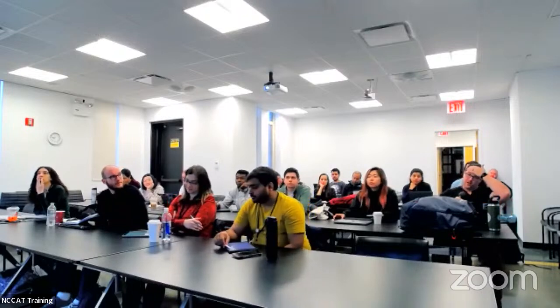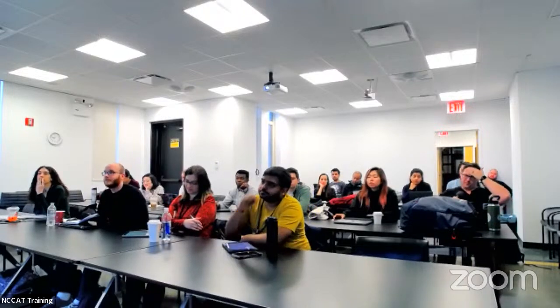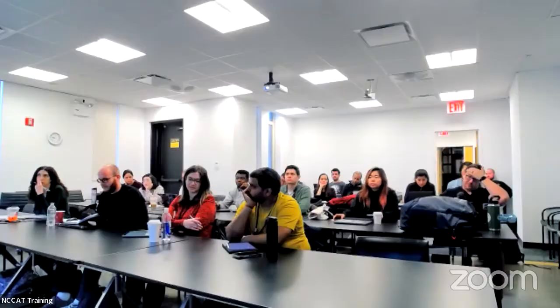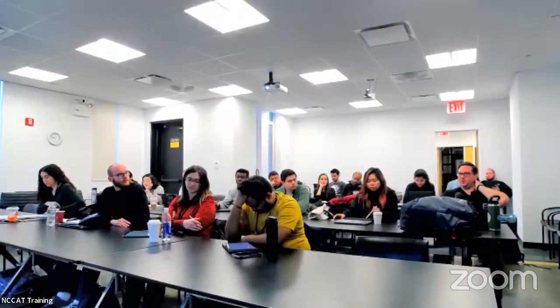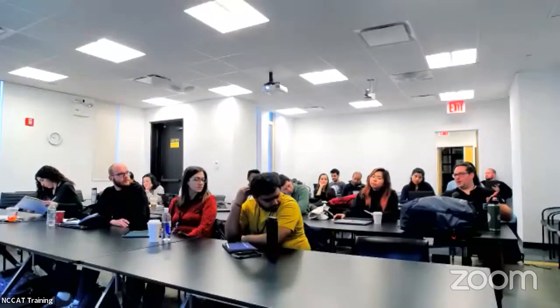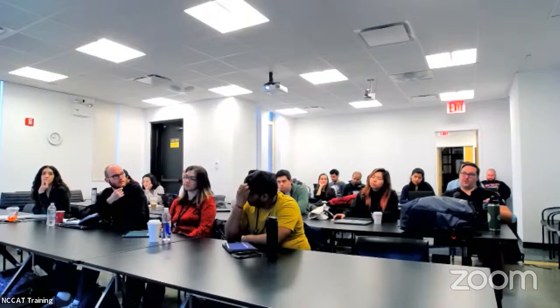Hi, Fred. Thanks for the great seminar this morning. I have a question that's kind of been plaguing me for a while now about spherical aberration. So you're saying it's important for essentially any kind of reconstructions below 4 angstroms, or at least signals below 4 angstroms. So does that mean when you're reconstructing something, let's say you're aiming for like 3.5 angstroms, does that measurement of spherical aberration in that microscope become essential? Do you have to be very, very accurate at that measurement? And how do you measure it?